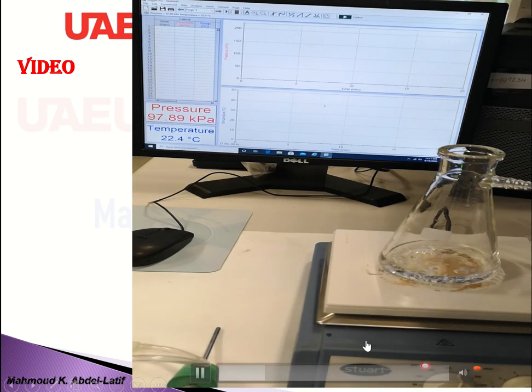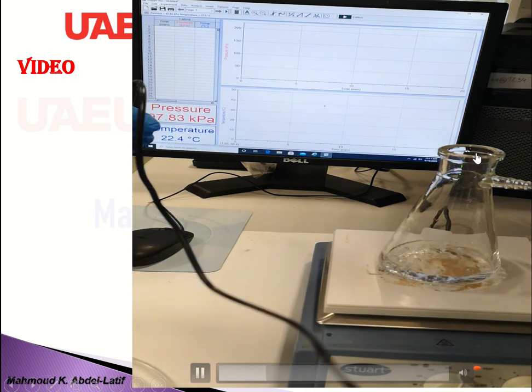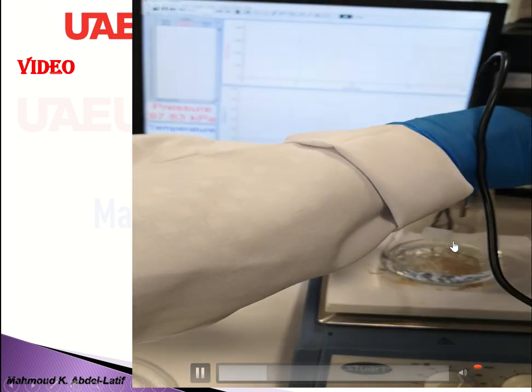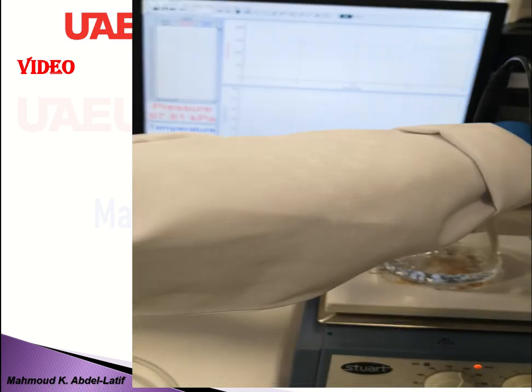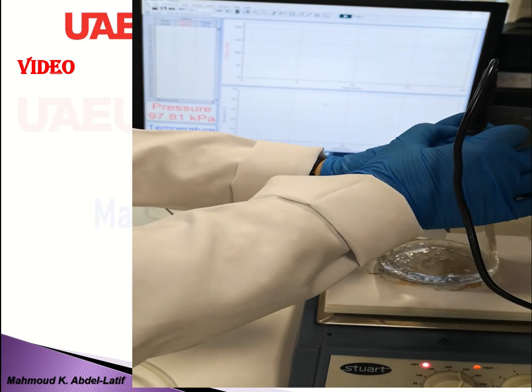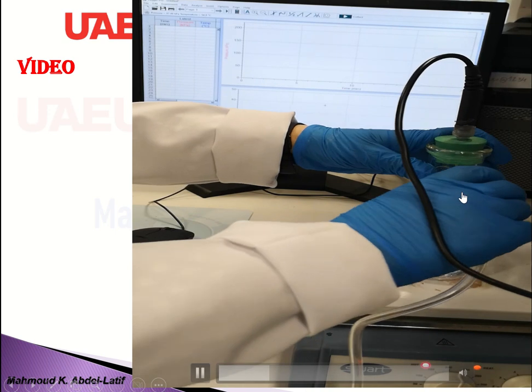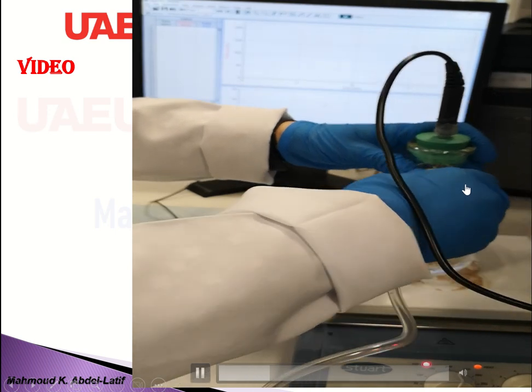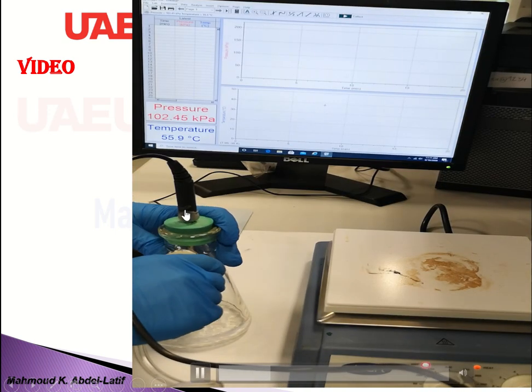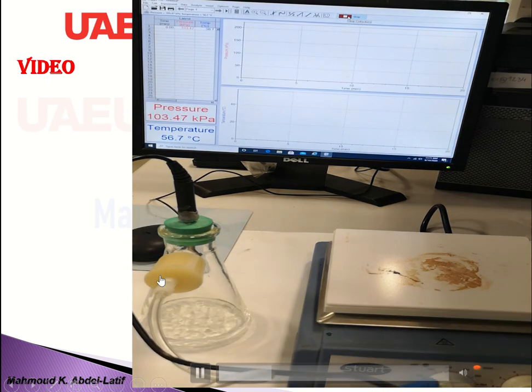Okay. Now we are going to fix the sensors. The temperature sensor will be from above. This is the Buchner flask. Be sure you close it very carefully, and there is no release of the vapor from it. And the pressure sensor goes from the side, not from the top. Be sure that there is no release of the pressure from here. Then start collecting the data.